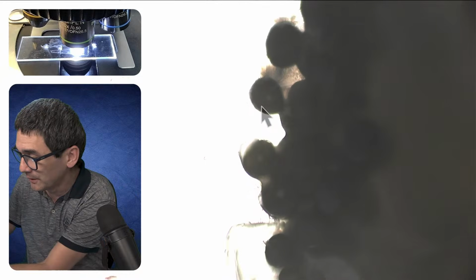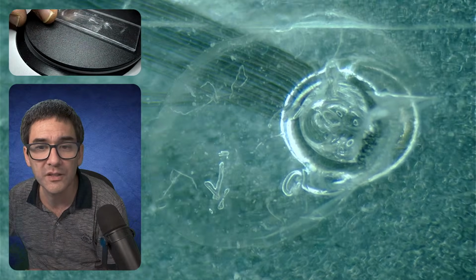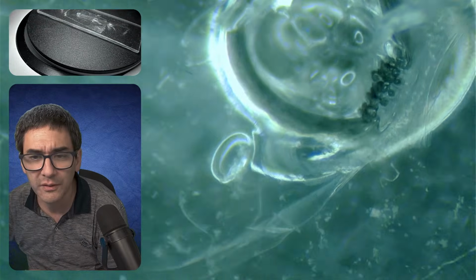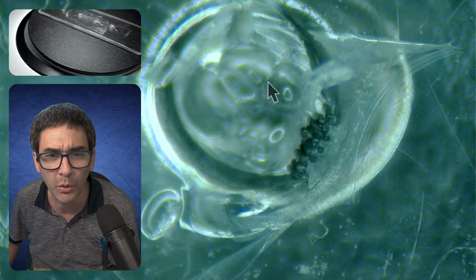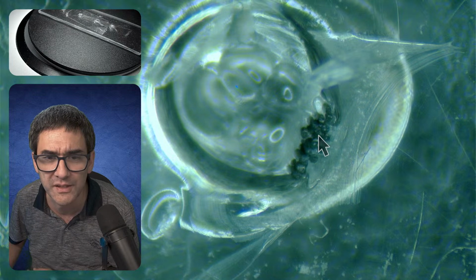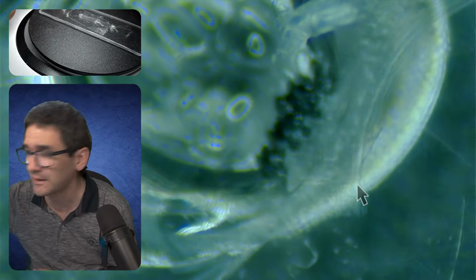I can show you that with the stereo. Last thing to show you today. Where is it? That's this one over here. So you actually see the arrow. That was the hole filled up with nail polish, and here you see the hair. It's all a little bit pressed to the side. So these are the hairs, and let's go up. I have to refocus again a little bit.